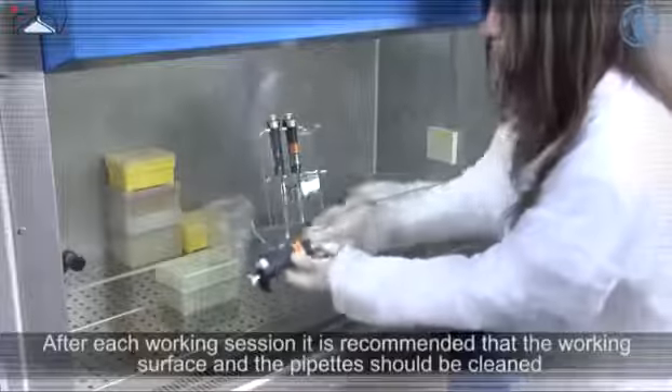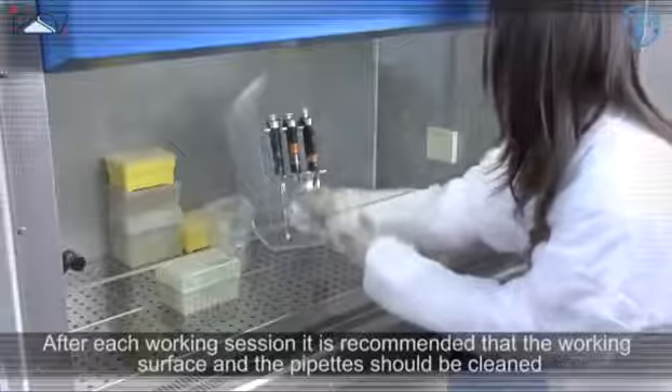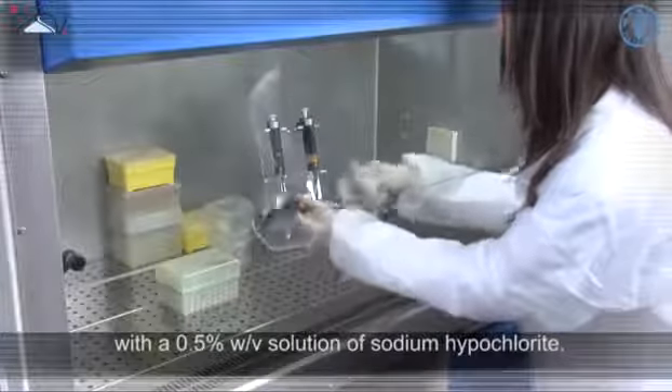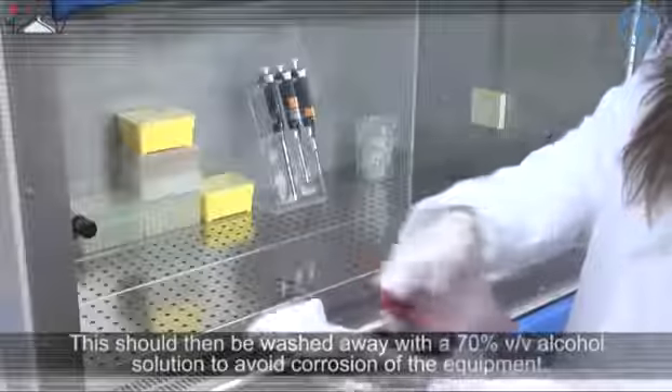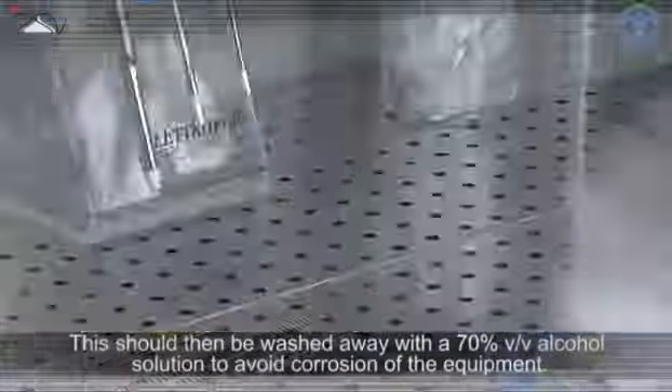After each working session, it is recommended that the working surface and the pipettes should be cleaned with a 0.5% solution of sodium hypochlorite. This should then be washed away with a 70% alcohol solution to avoid corrosion of the equipment.